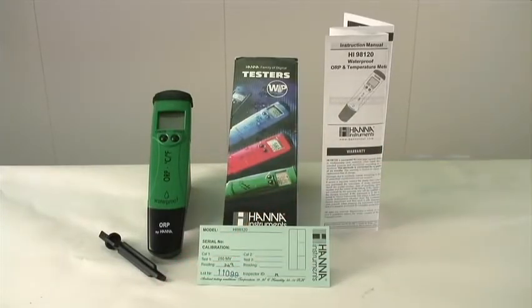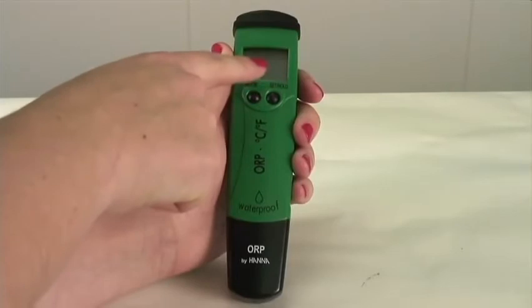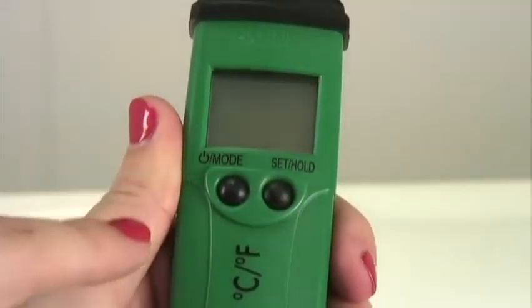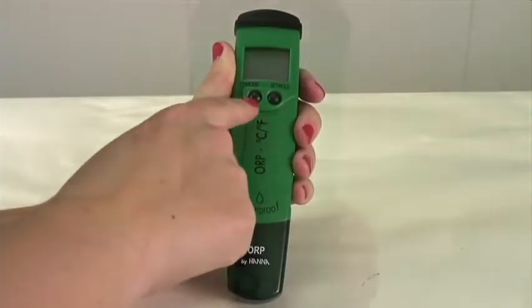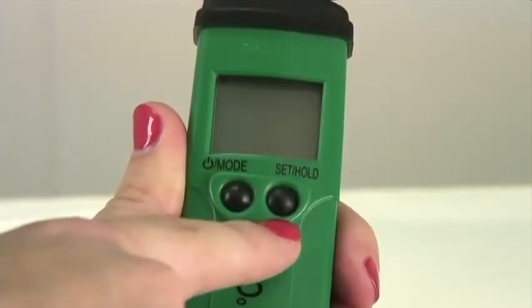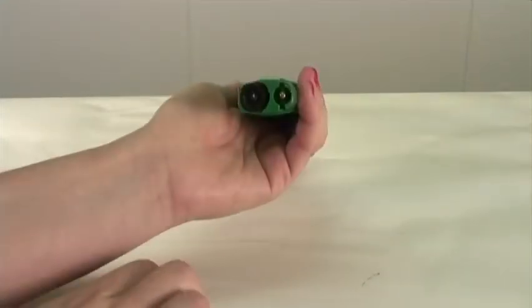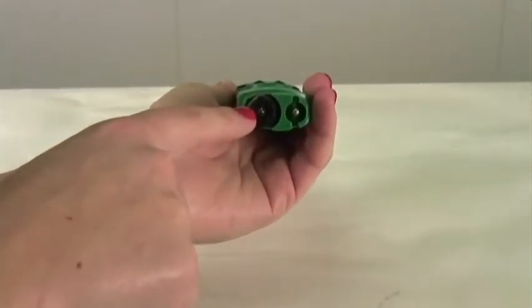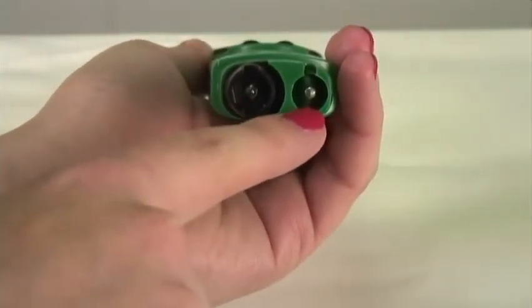Now let's take a look at the features of your 98120. Your measurements will appear here on the liquid crystal display screen. You operate your meter through these two easy-to-use buttons. After removing the cap, you can see the ORP electrode and temperature sensor.